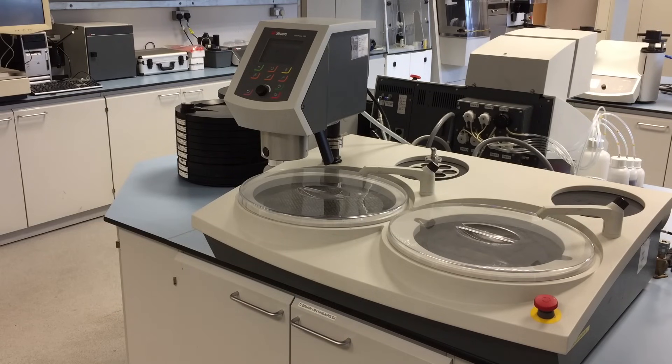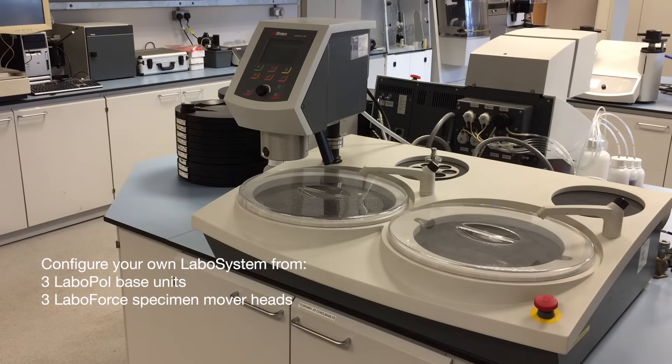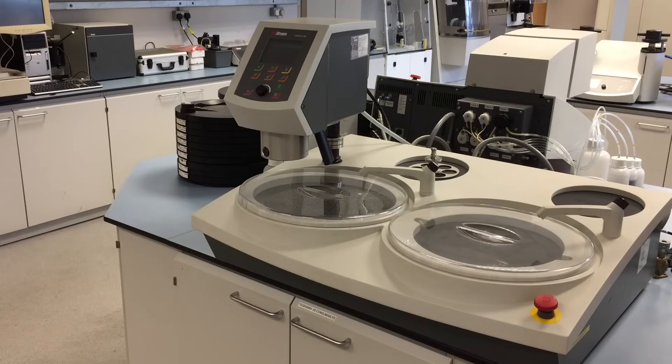The LAVO system offers a choice of 3 LAVO polisher units, all of which can be operated manually, 3 LAVO Force specimen movers for semi-automatic preparation, and 2 LAVO DOSA dosing units. This gives many compatible different variations, providing flexibility for your changing business needs.